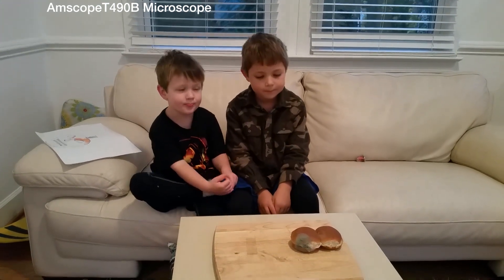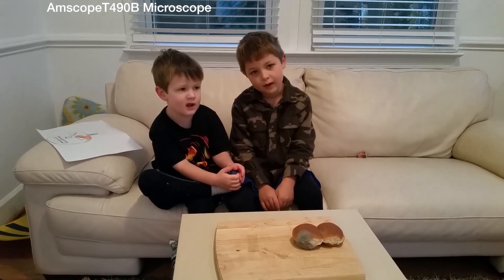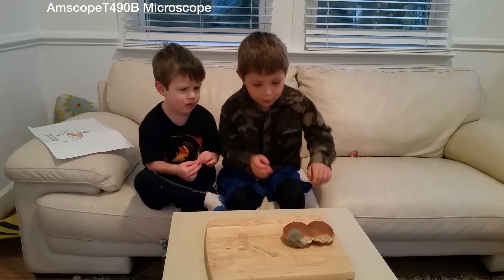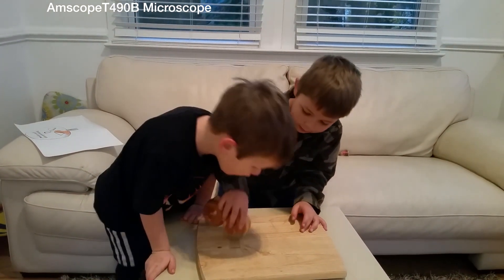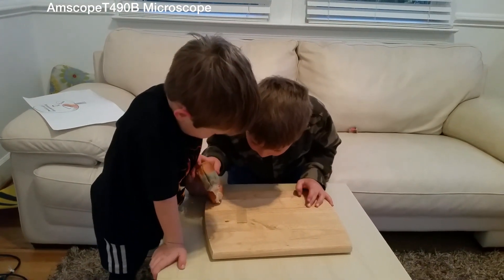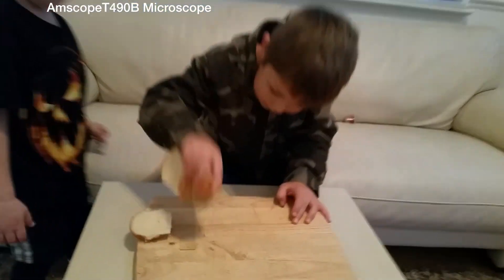We're going to take some of that mold, shake it onto the slide, and try to look at it under the microscope. Alright, so Lars, take some of that moldy bread and shake it over the slide. Tap it on the slide. Is any of it coming off? No. Let me see. It looks like it. I think it is.